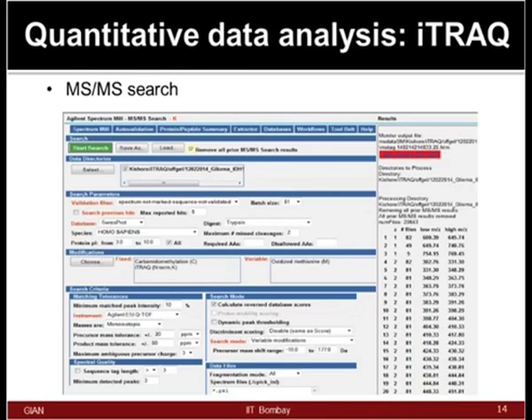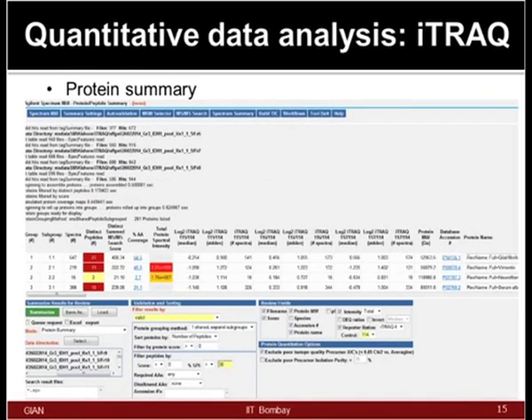And you also have to mention how many peptides you minimum want to see, that is, only one or more than one. So, all of these parameters are very critical, and I am sure when you do the analysis today, by changing them one by one you will see how much impact that makes in terms of the overall data availability.